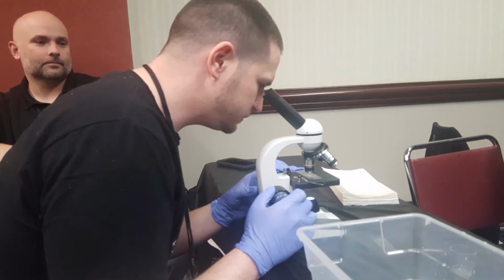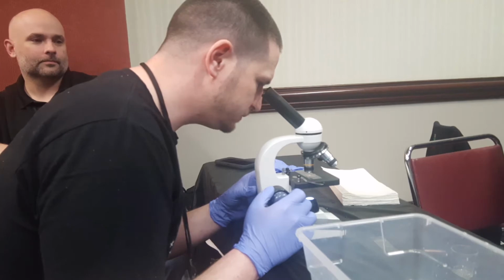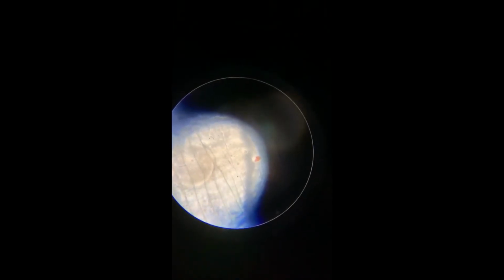Chris is the owner of Carolina Aquatics. They're a wholesaler based out of the region. If he'll let you do tours, that'd be cool, but I don't know if he would. But here's a link to his channel if you can't visit. And in this video, you can see to the left, there's a little bit of ick just floating around. And then if you look really closely, you can actually see costia.